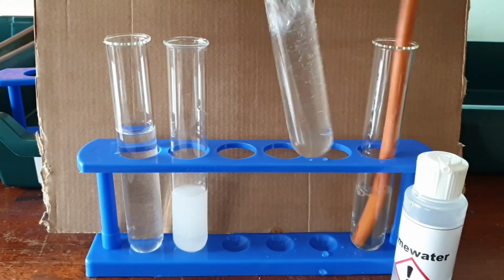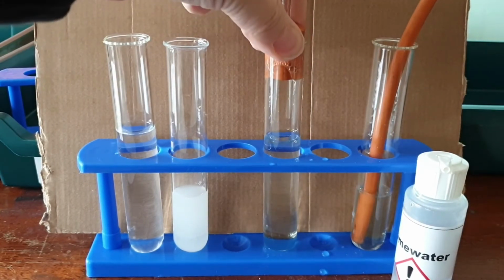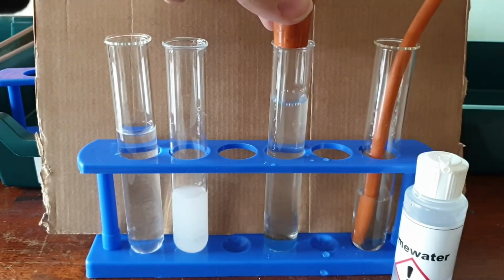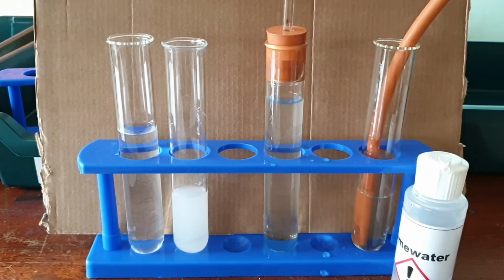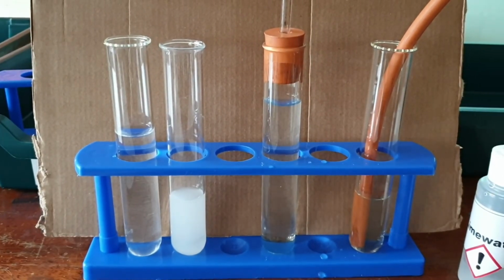This is enthralling, right? It's still not enough. Brilliant. Means I've got to add some more of the other one. Shouldn't have added so much lime water. Okay, right. Imagine that's gone cloudy. Woo. Okay.